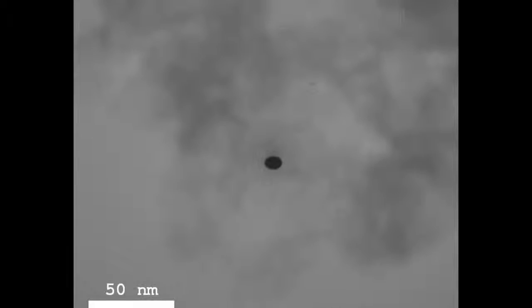And the only real way to know what is actually going on here is to model the whole system. And that can be a very hard task to do, especially if you combine several diffracted beams with this central beam, and especially if the sample itself is very complicated. If it's very clean and nice big crystal lattices, then it will become perhaps a little bit easier for you.